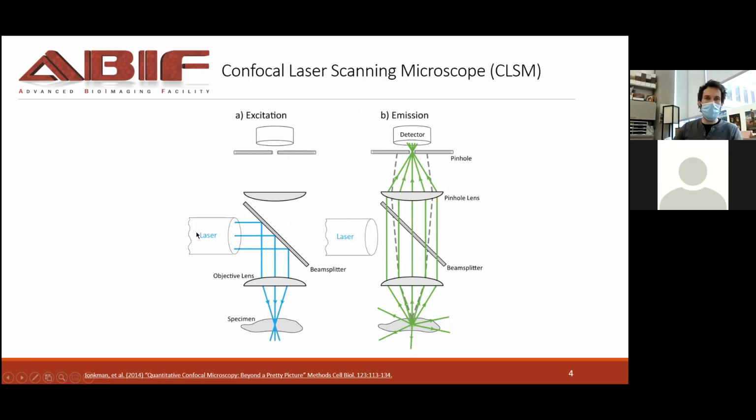You already received your training on widefield, so we won't go over fluorescence directly, but we'll talk a little bit more about the light path involved in the confocal. On the excitation side, we usually excite our molecules using a laser. Using a laser allows high intensity and a very narrow bandwidth, and gives us nicely collimated light that we can really focus into a spot.